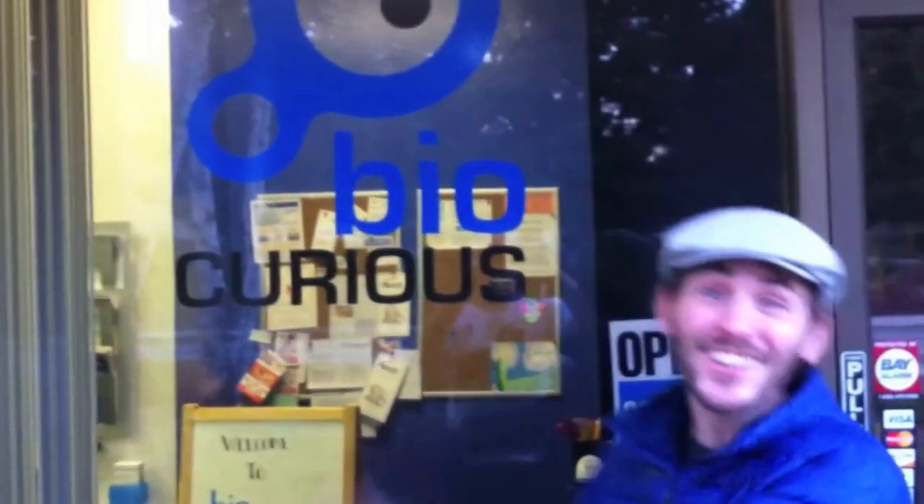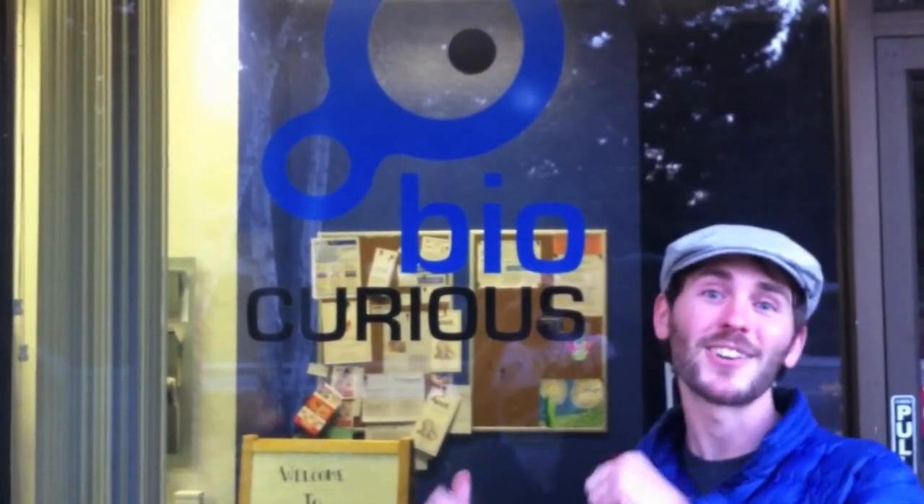Hey guys, Curious John here, and I'm at BioCurious. I'm really excited about this space. I've been following them for months online. When I saw them first come out, I was really, really excited. Now I'm here in person to check out the space and get into some biohacking. Come with me and I'll show you around.